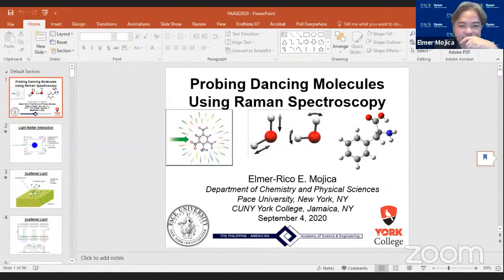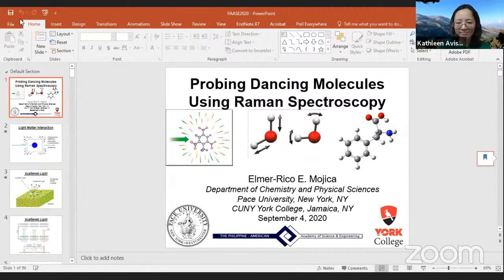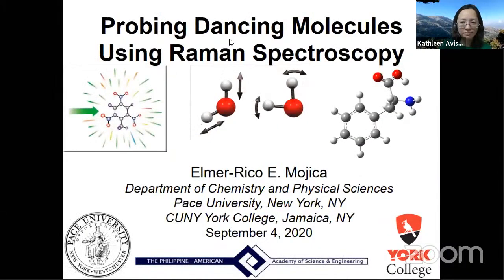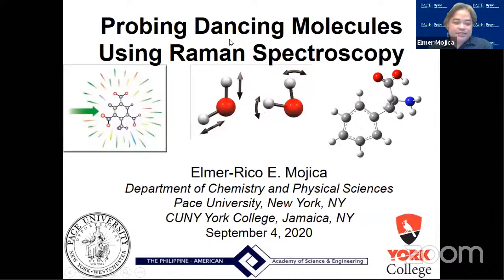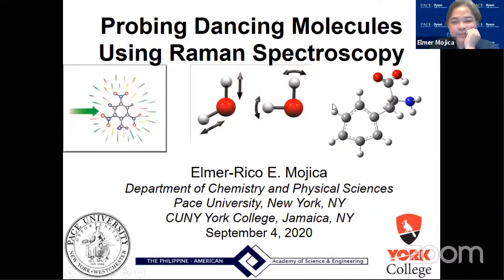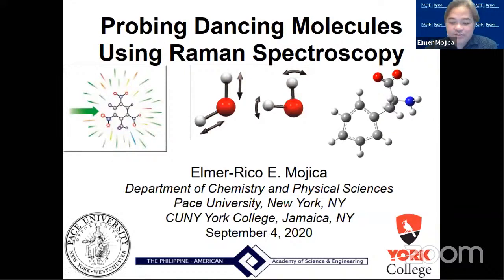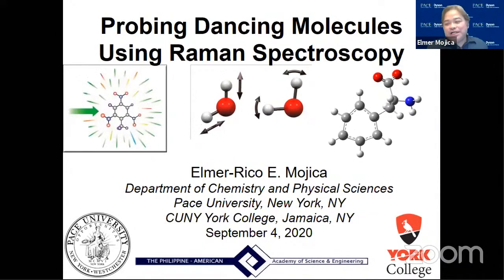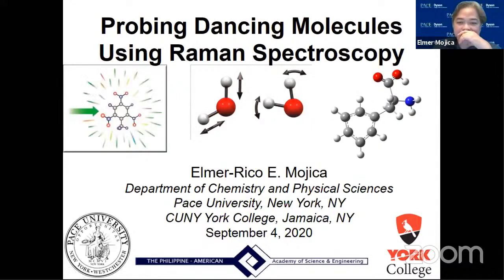Thank you very much, Kay, for that kind introduction. So today, I'm going to share with you what has been done in the field of Raman spectroscopy. The topic that I'm going to discuss today is just what I have done for the last, I would say, 9 years in Raman spectroscopy. To add some sort of taste to the title, I put there probing dancing molecules, because Raman spectroscopy is really vibrational spectroscopy.